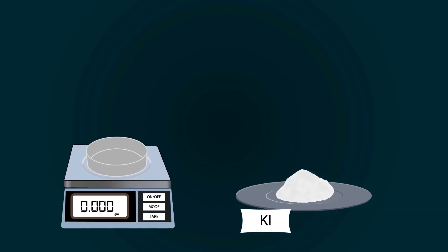Now start adding potassium iodide into the petri dish with the help of spatula. Weigh precisely up to 5 grams.